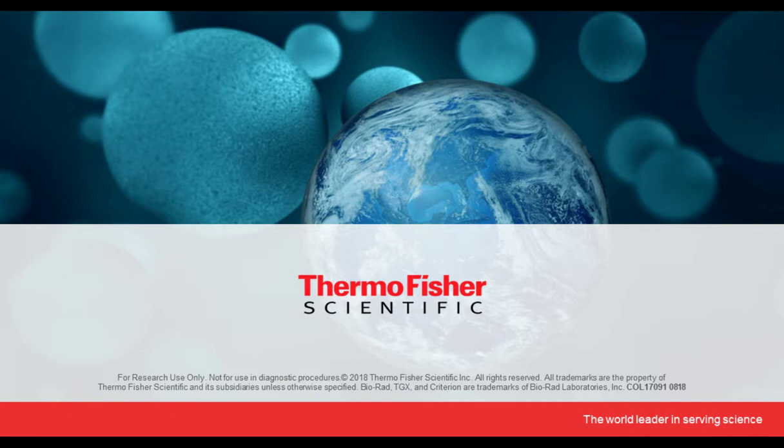Thank you. Next one is, can I run reduced and non-reduced protein samples on the same gel? Typically we do not recommend doing that. For some reason, if you have to run reduced and non-reduced sample on the same gel, it's important that you don't run them side by side. The reason being that there can always be a little bit of spillover, and then the reduced sample can compromise the integrity of the non-reduced sample. So if possible, prevent running them on the same gel, but if you have to, then definitely don't run them in lanes next to each other.